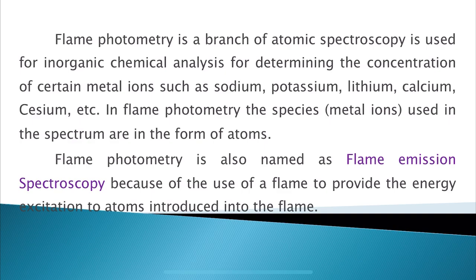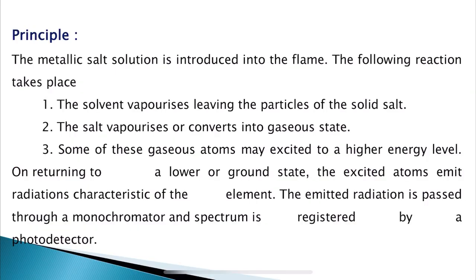Flame photometry is also named flame emission spectroscopy, because here the flame provides the energy for excitation of atoms introduced into the flame. That is why we call it flame emission spectroscopy. Now let us move on to the principle involved in flame photometry.